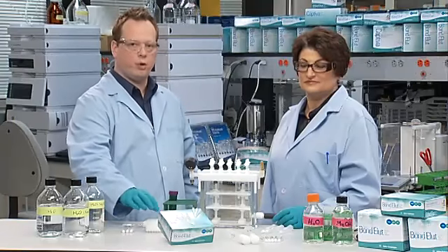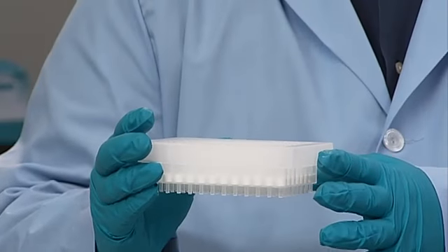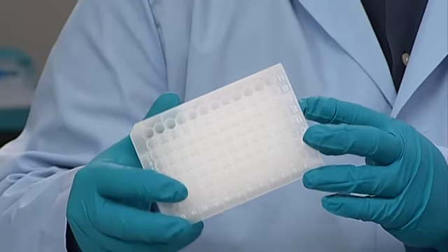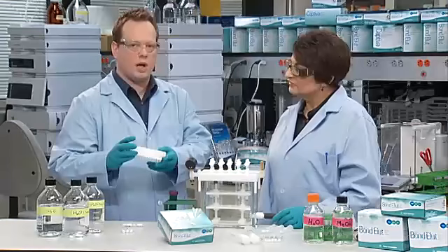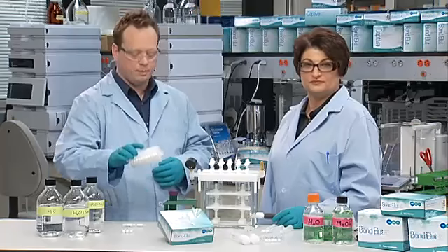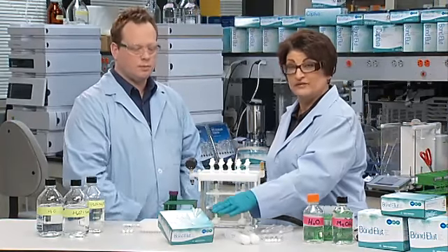The 96 well format is another great option to consider. The 96 well format is based on a 96 well plate design, in which the SPE material is packed into individual round or square wells. The SPE material can be placed into the wells, which can accommodate a 10 to 100 milligram bed mass and 2 milliliter maximum volume. And last but not least is the pipette tip format.